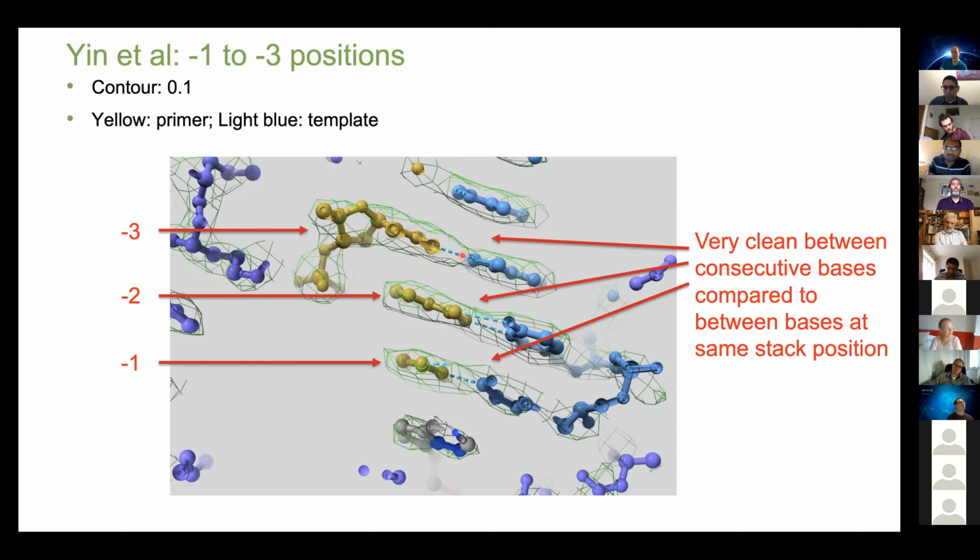You might not have paid attention to that, but in the presentation previously given, I do believe, we very often have problems. That's why it would be essential in general to deposit the distribution of angles of the data which have been used, because here the local resolution might be significantly better, but in other cases the local resolution might still be okay but the result will be wrong.